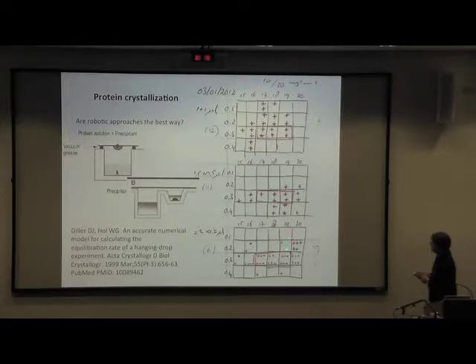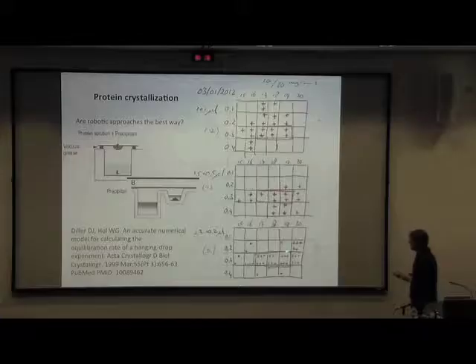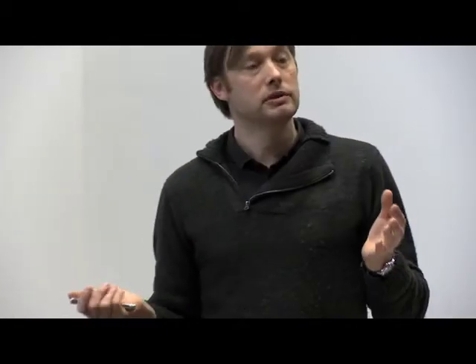These were actually multiples of the same condition. Here I did the experiment 8 times, one at 10 and one at 20 mg per ml. Out of 8 drops, I only got crystals in 1. That means that if you set up a crystallization series of 2,000 drops, you might well be missing many conditions because you're just not optimally screening.